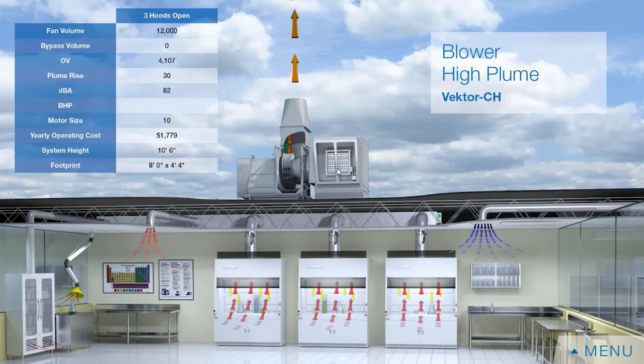In terms of sound and efficiency, you won't find that an inline or a centrifugal has advantages over the other. Both have pretty consistent efficiencies as well as overall sound levels.